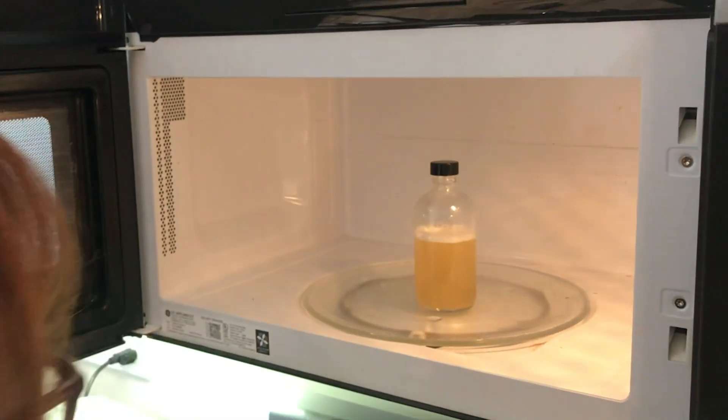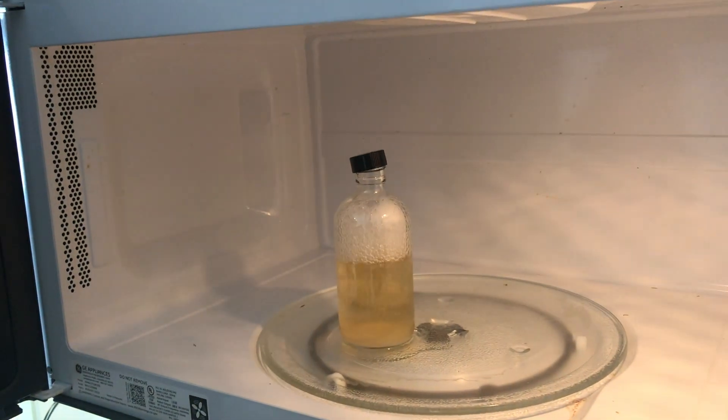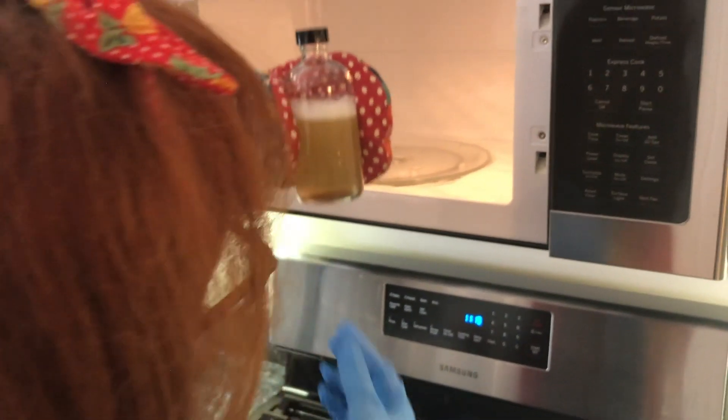You heat the mixture to dissolve it. You have to heat it carefully because it froths up quickly and goes everywhere. Let it cool for about 30 minutes, but don't leave it too long or it will go clumpy.